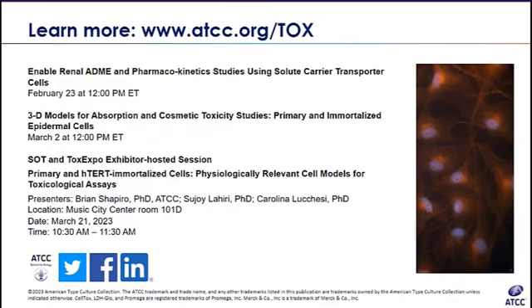Again, we verified this through PCR. So it's 5 and 3 respectively for OAT1 and OCT2. All right, good. I like it. Now let's see. Okay, have we ever tried expressing both OAT1 and OCT2 in the same line?